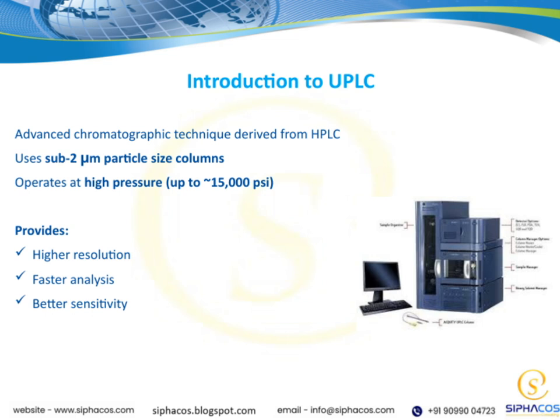Now, what does this mean for us? Well, UPLC provides higher resolution, meaning we can distinguish between compounds that are very close in structure more clearly. It also allows for much faster analysis times, which is a huge advantage in busy labs. Plus, it offers better sensitivity, so we can detect even trace amounts of substances with greater confidence. Overall, UPLC is a powerful tool that enhances our ability to analyze complex mixtures efficiently and accurately, fitting perfectly into our goal of improving analytical performance in the lab.